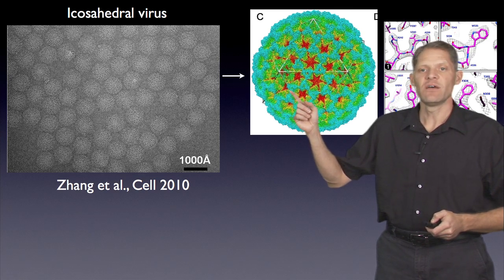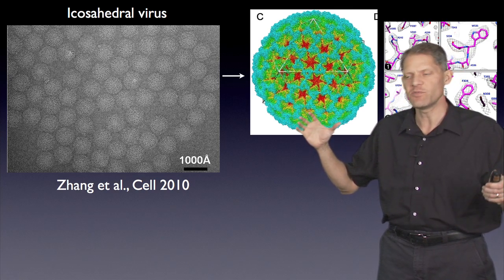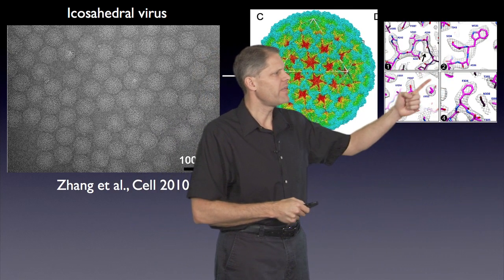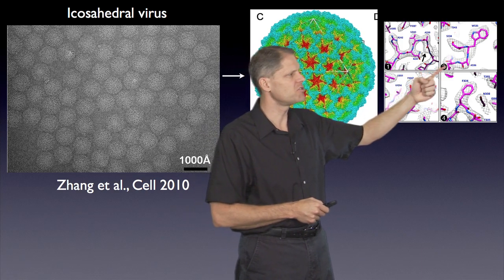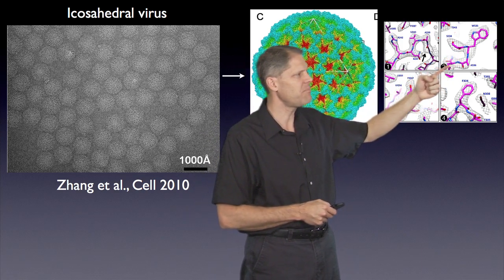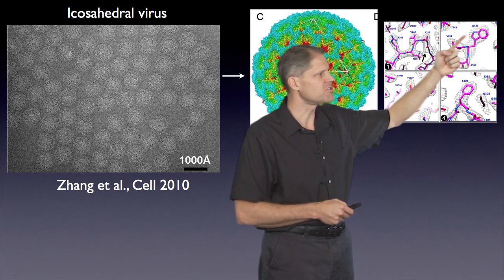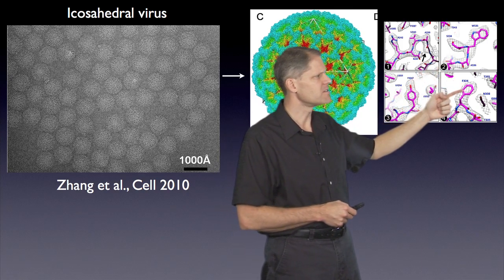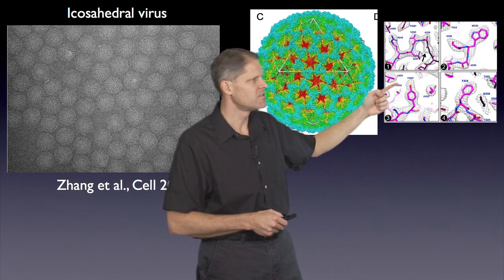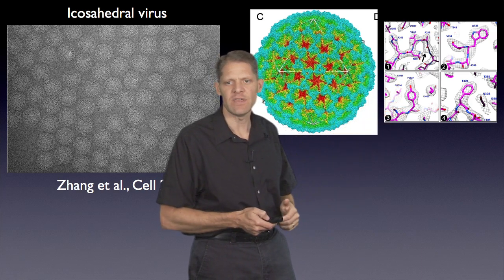And if we zoom in on one particular place within this very large reconstruction, if we zoom way in and look at individual features, we can see that the map has enough resolution to resolve not only the alpha carbon backbone of each of the peptide chains in there, but also distinct side chains. So here's a tryptophan, here's a phenylalanine, here's a tyrosine side chain. So the EM map was clearly good enough to build an atomic model of the virus.